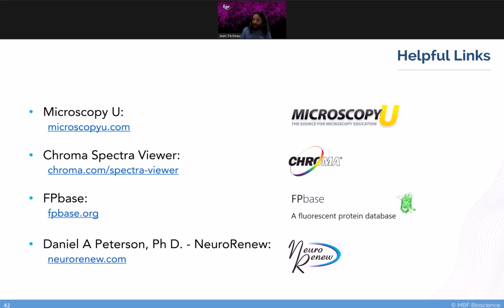Next, we have FPBase, which is a fluorescent protein database. This will give you a lot of information about both the fluorescent behavior of the proteins that we're talking about and also the chemistry that's involved with them.